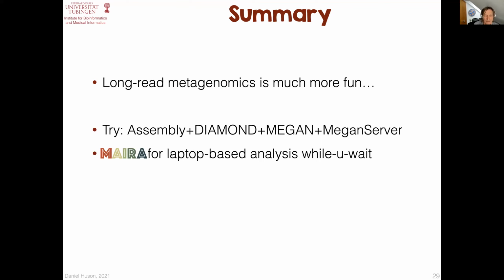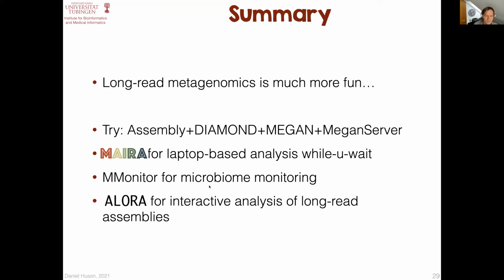MAIRA, I described MAIRA, which is our laptop-based analysis while you wait tool. While you wait for the sequencer to finish, you could already start seeing what's in your sample. Then we've got the MMonitor for microbiome monitoring if you're running bioreactors and you want to do that in a systematic way. And then I just talked about ALORA. That will be a new tool for interactive analysis of long-read assemblies.